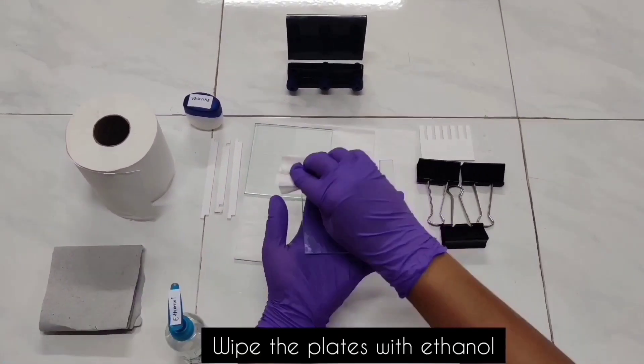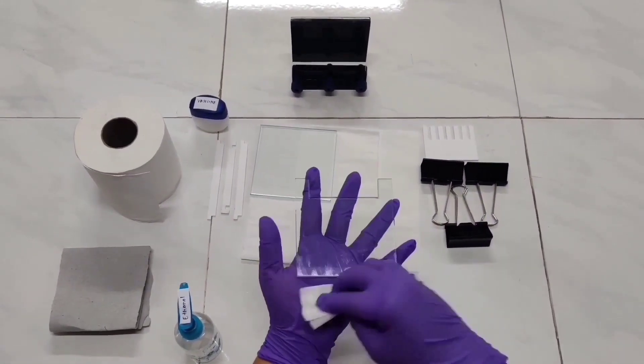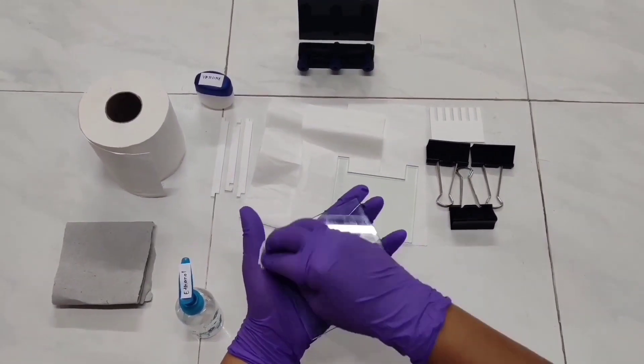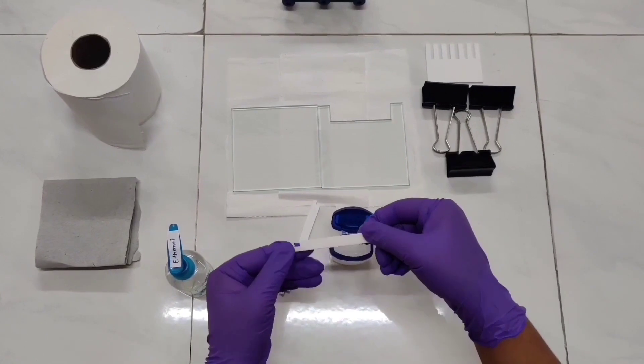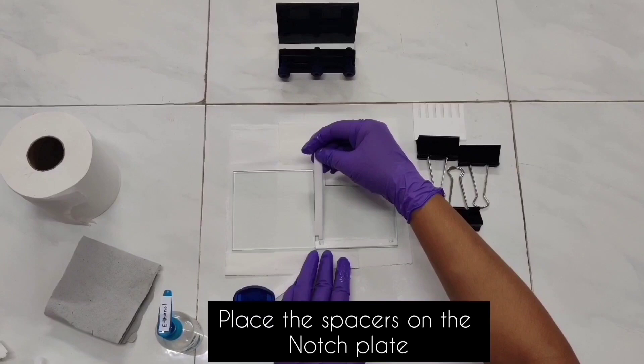Now let's see how to set up the gel plates. Before preparing the gel, the gel setup must be made ready. All the plates are cleaned using ethanol. On the bottom and sides of the notch plate, spacers are placed by applying Vaseline to them on either side. This step is done in order to prevent any kind of leak.